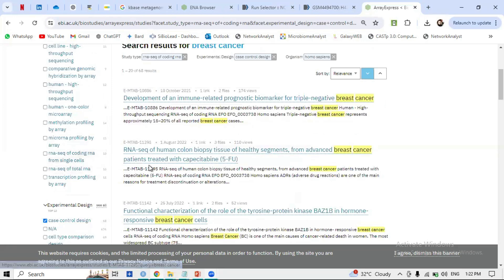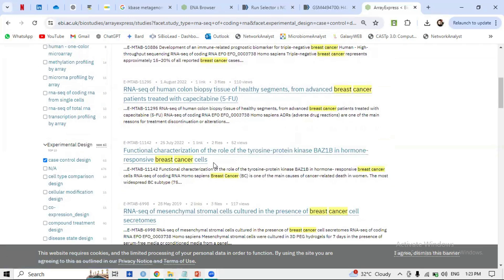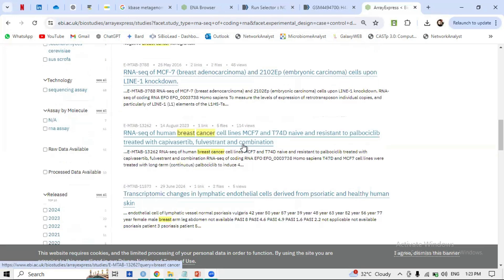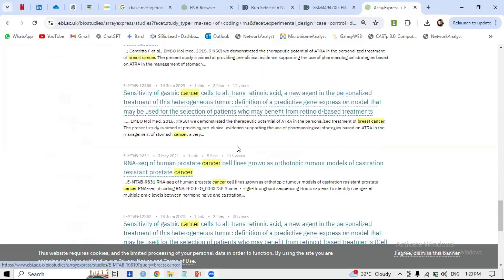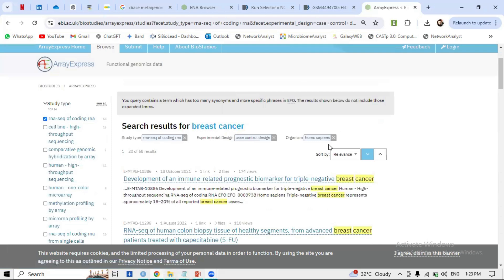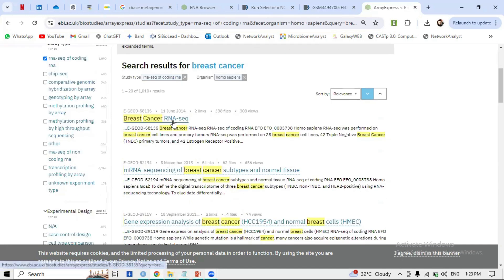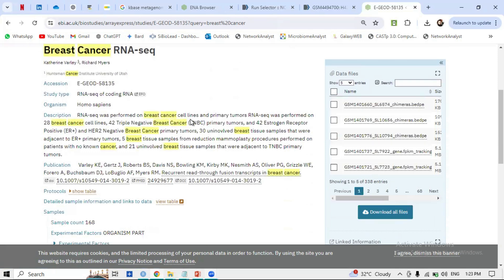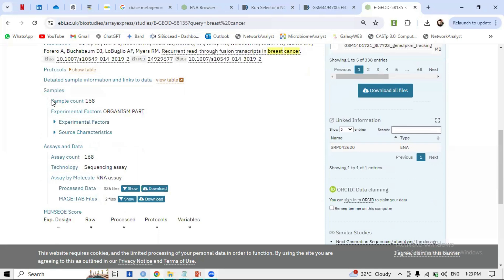For example, 'RNA-seq of human colon biopsy tissue from advanced breast cancer patients treated with...' — that is a treatment study, so we're not interested. There is also 'RNA-seq of human breast cancer cell lines.' If interested in cell lines, you can go for that. There are also prostate cancer studies, so filter specifically for breast cancer.